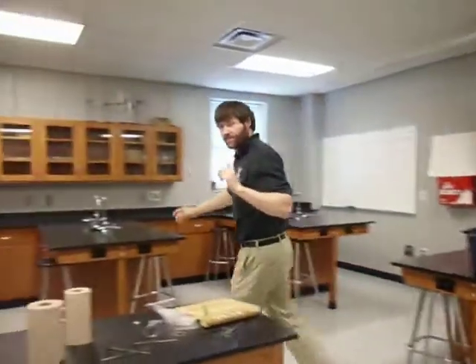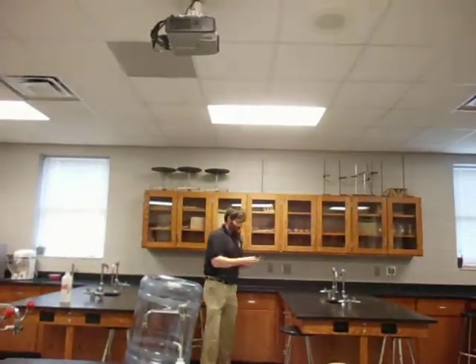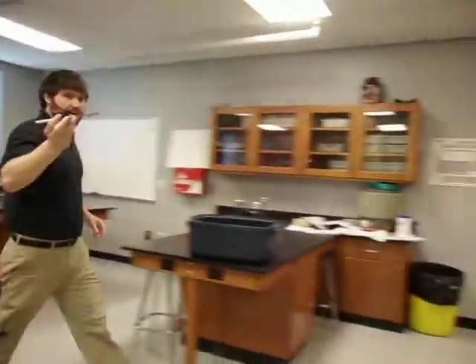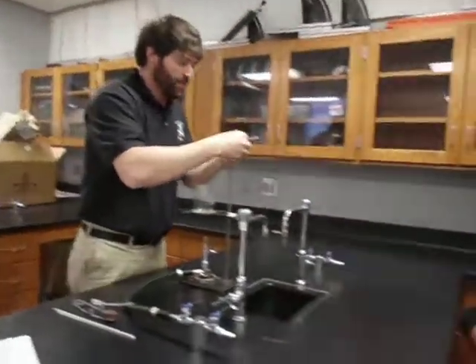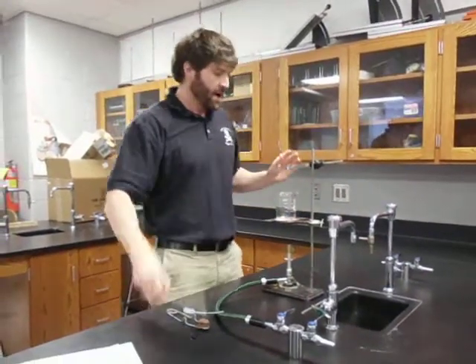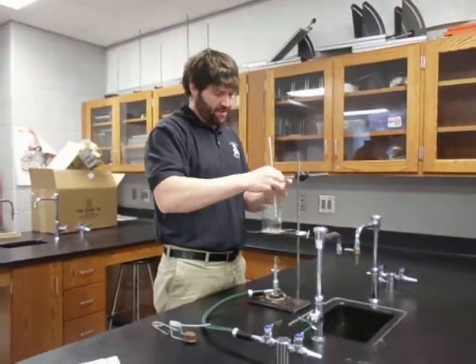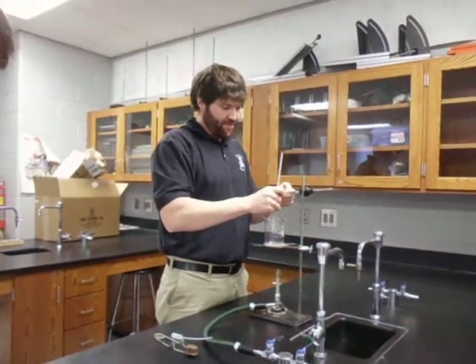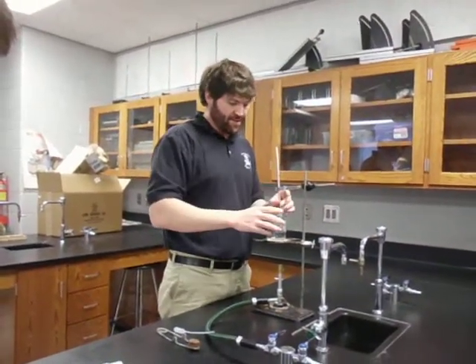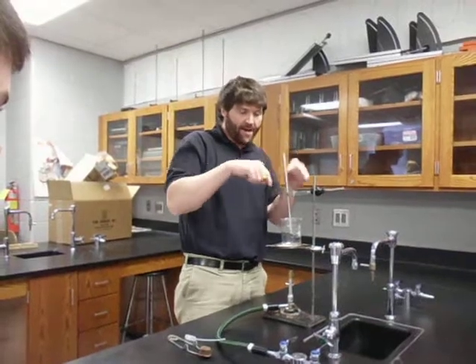We're going to need two more things. In this cabinet is where we keep the thermometer clamps. We're going to put the clamp up on top of the ring stand, clamp it down, and aim it so the thermometer will be in the center of the beaker. We can take the thermometer, put it in, and tighten it in place. A little word of advice — sometimes a thermometer doesn't want to fit in there very well. If that happens, you can take a little piece of paper towel, wrap it around your thermometer, and it'll really help clamp it down.